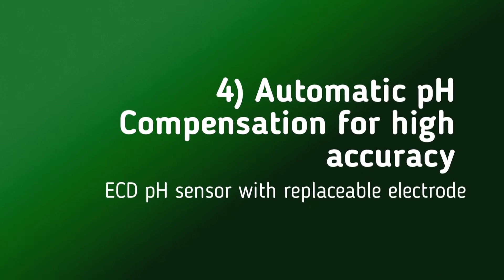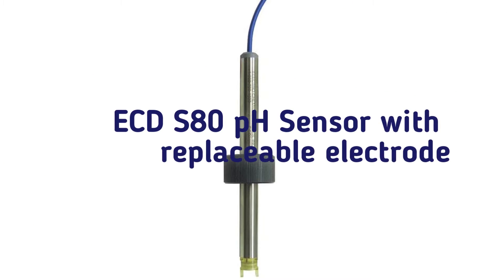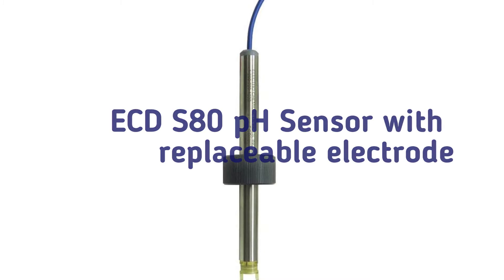Higher accuracy with automatic pH compensation. Easy replaceable pH electrodes with ECD's S80 sensors.